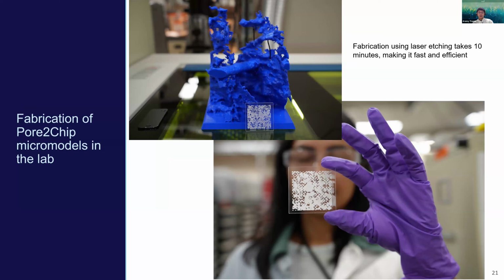It's just that at some point, if you want really high detail, we would prefer to use photolithography, because a lot of the experimental chips we've been doing are with the laser etcher that can give us really fast results, but gets us down to maybe around 50 micron pore sizes and pore shapes. Does that answer your question, Charlie?